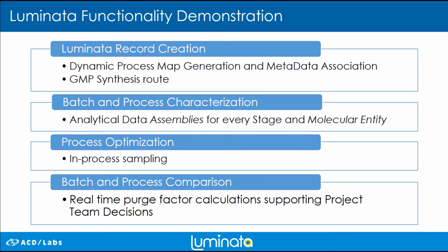Now, once we go into the next workflow, we're going to go into process optimization or in-process sampling. The idea of just taking a sample and really delving deep into the 1 or 2 step reaction and going through the reaction completion, the filtrate, and the isolated product. So the whole workup procedure. And from there, we can also talk about purge studies, which would be a later focus as well. So let's go into the software.